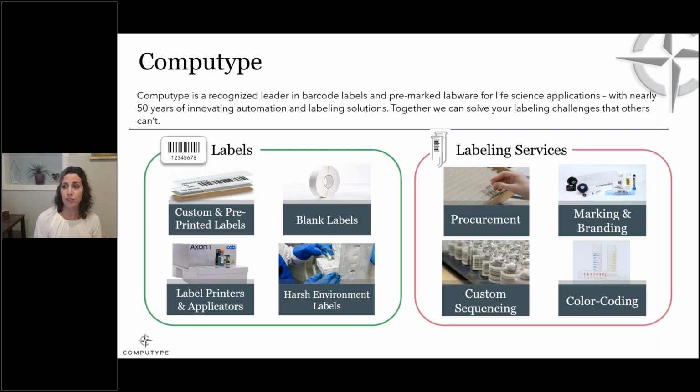Today, we are going to review some methodologies for labeling labware, and we are going to help you figure out what's right for your lab.